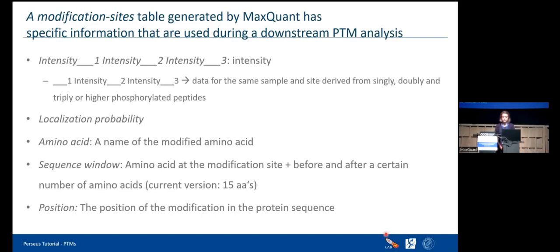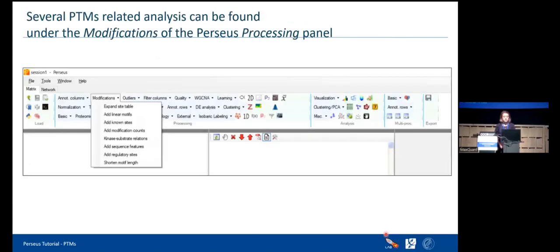Another column is the amino acid information — which residue is actually modified. We also have the sequence window, which currently has 15 amino acids showing sequence context before and after the modified residue. And we also have the position information — the residue number where the modification occurs. All PTM-related analyses can be found under the modification tab in Perseus. Several of my colleagues have already done the pipeline, and we'll add modification-specific information on top.